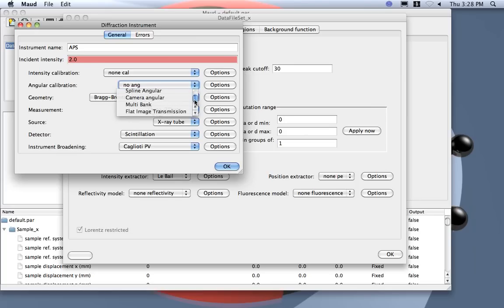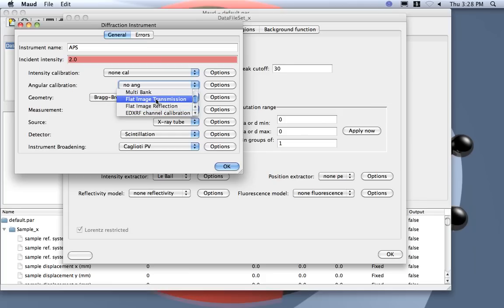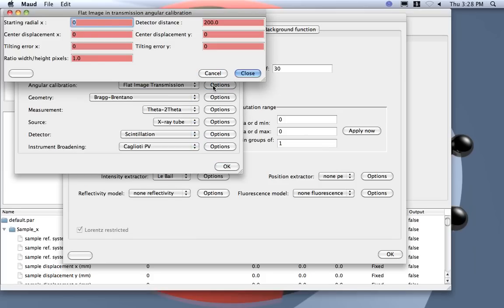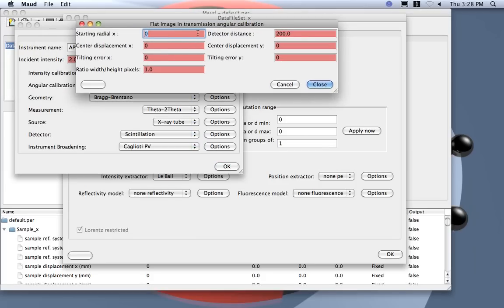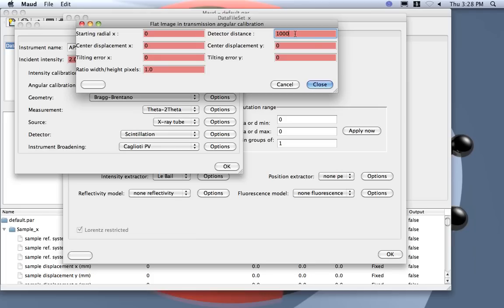So I need here to use this flat image transmission. This is to calibrate, to transform flat image transmission coordinate into theta coordinate. So I need to put detector distance, I will use millimeter and approximately this was the distance between the sample and detector. The MAR was around one meter, a little bit more, we will see later.